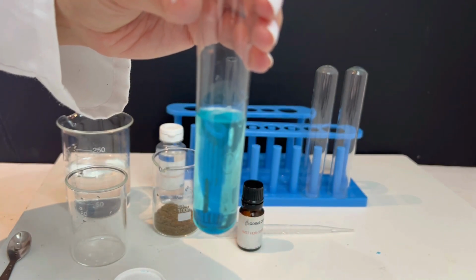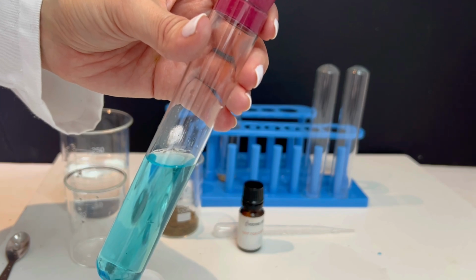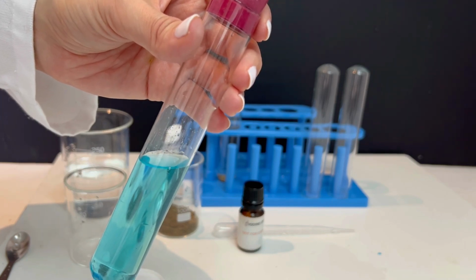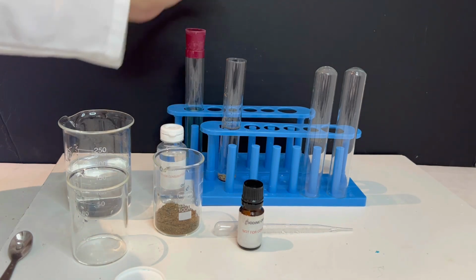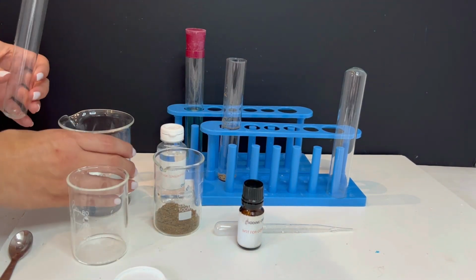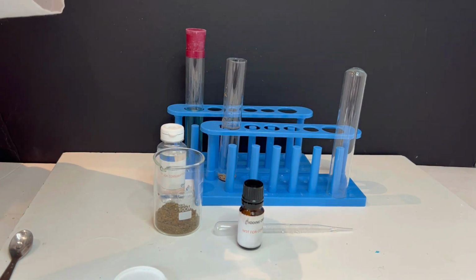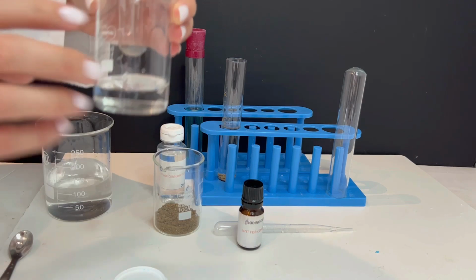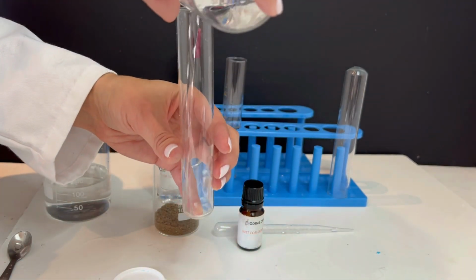Notice how the copper sulphate dissolves completely, forming a clear blue solution. This is a homogeneous mixture. Next, we add about 20 milliliters of water and a spatula of iodine crystals to the third test tube.